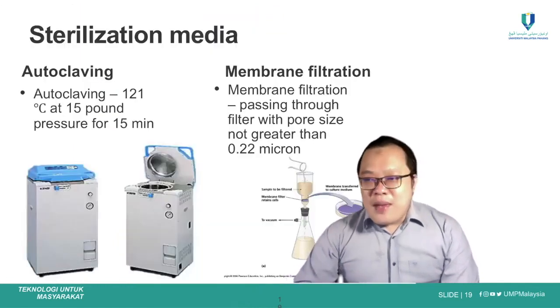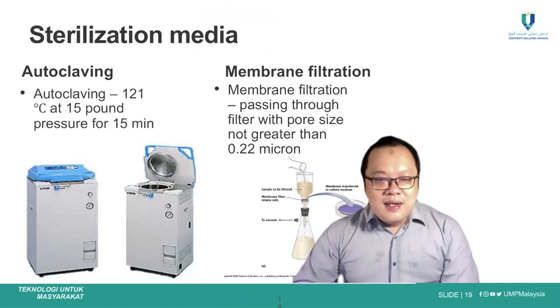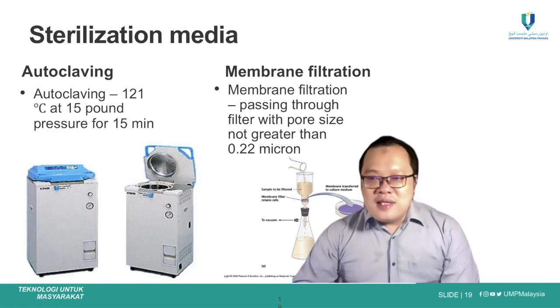After we have prepared all these media, we need to sterilize the media in order to kill all those microorganisms in the prepared media in the lab so that it will not contaminate the isolation of the bacteria and also the fungi that we want to isolate.